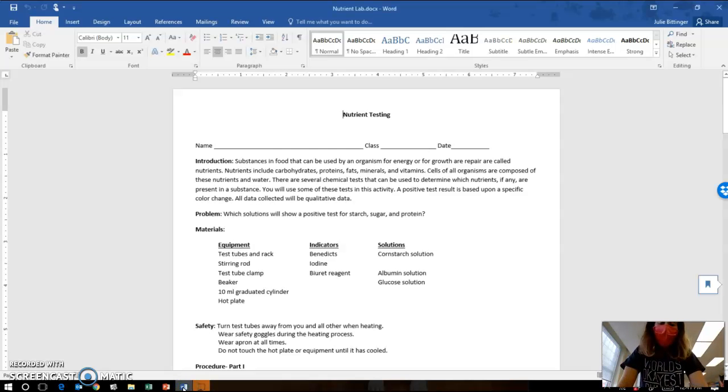It's Miss Bittinger, and I am making this video for remote learners only, or if you're absent, for this nutrient test lab. This is a lab that we always do, typically before the biochemistry chapter lab, but just due to time and due to COVID, I didn't do this lab. Now all the in-person learners are coming back, so I want to do it.